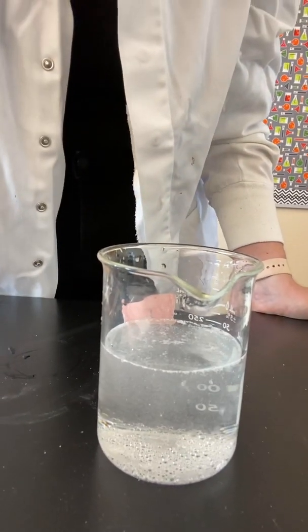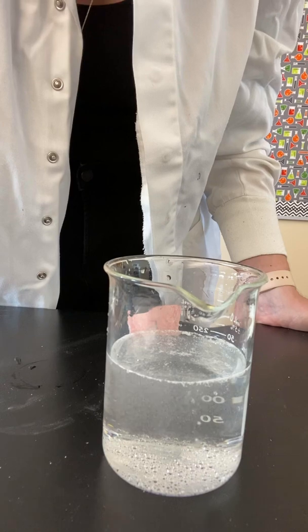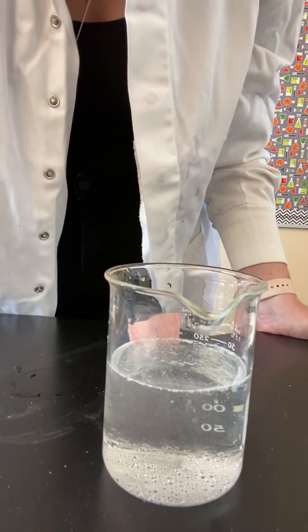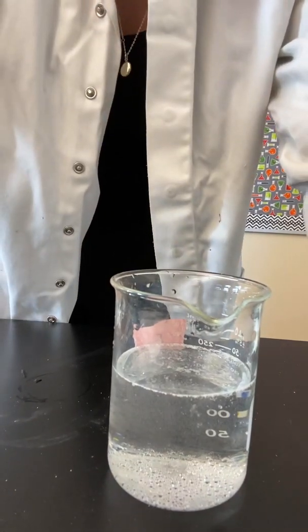Just a little bit left there that's reacting. And time. Go ahead and stop your timer.